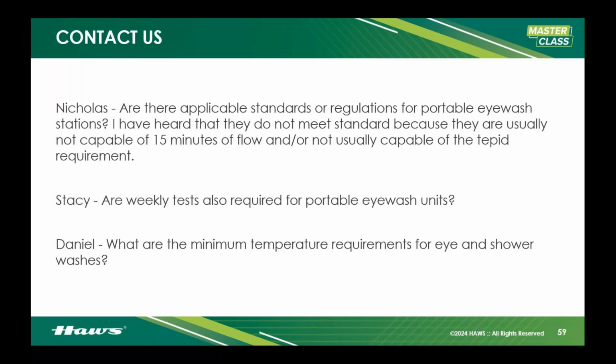I will warn you, though, there are types of emergency equipment out there that use a bladder system. And once it is popped, there's no stopping it. It's like Pringles. Once you pop it, you can't stop it. And that bladder will run out, which, if you're hitting your annual requirements and following the rules, means you're going to have to purchase another system, and that's not ideal.